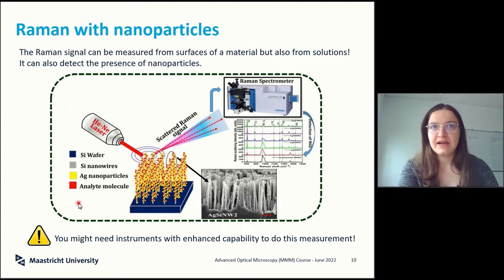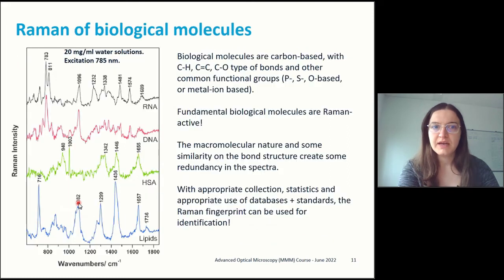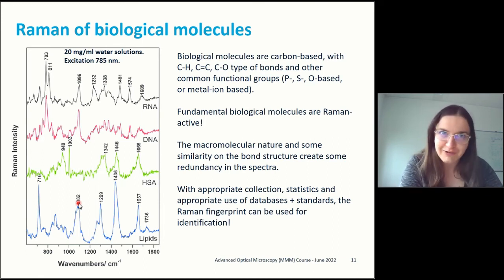But I feel like the most interesting part for most of the attendees of this workshop is actually the Raman of biological molecules. So biological molecules are carbon-based, but Raman doesn't care that you have very light atoms.